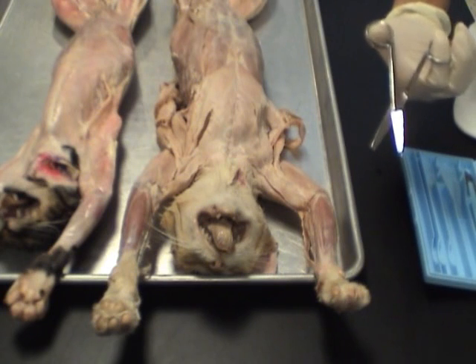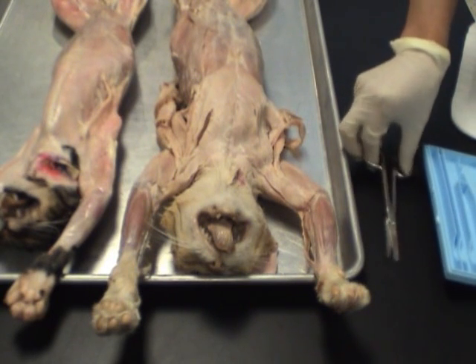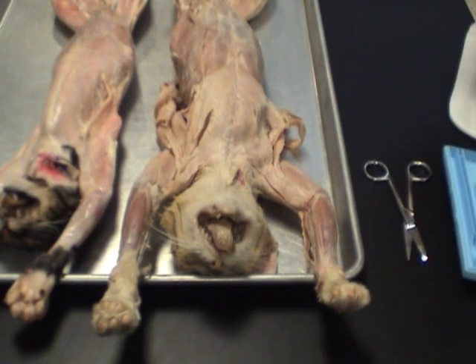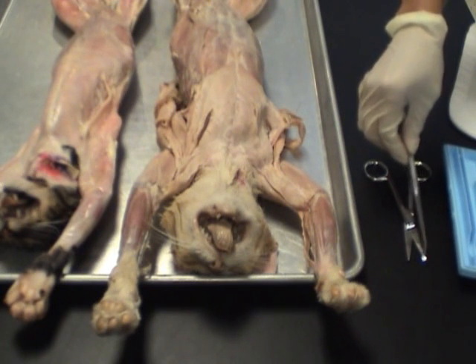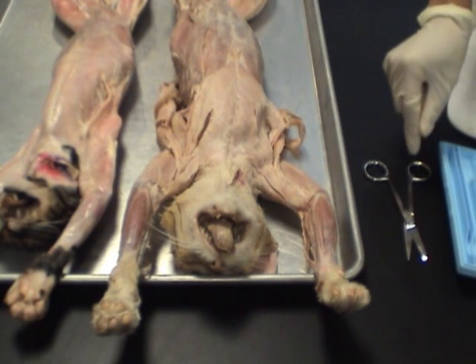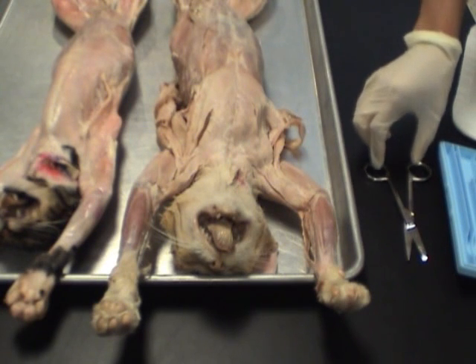Okay, now scissors are for cutting, as you already imagined. Notice that in this particular scissor we have a sharp end and a blunt end. When you cut, you want to always cut with the blunt end down, because if you cut with the sharp end down, you may be piercing structures that you don't want to pierce.